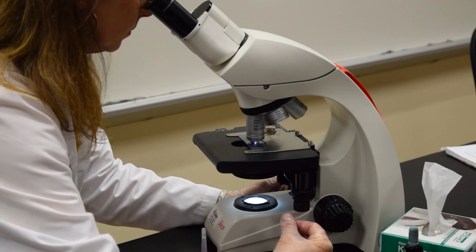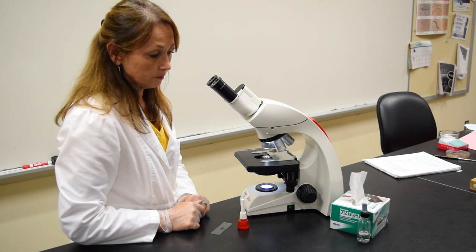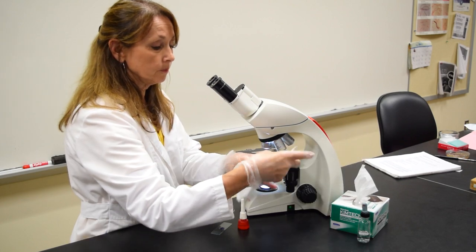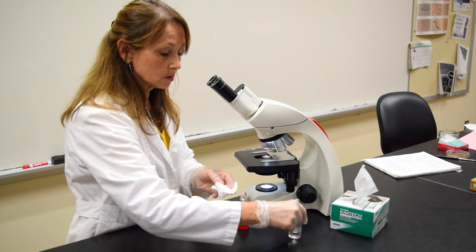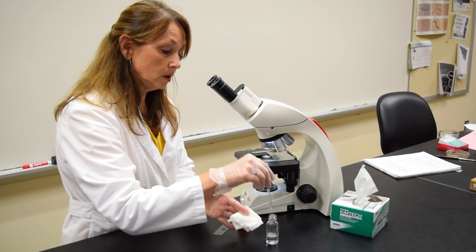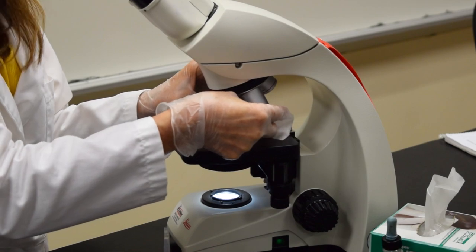After I have looked at the slide, I'm ready to remove the slide and to clean the oil immersion lens. I'm going to move the scanning power back in place and remove my slide. To clean the oil from the oil immersion lens, I'm going to use Kim Wipes as well as my acetone. I take one or two pieces of Kim Wipes, fold it over several times, take a full dropper of acetone, and saturate the Kim Wipe.